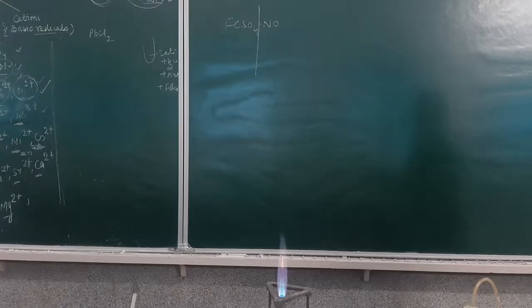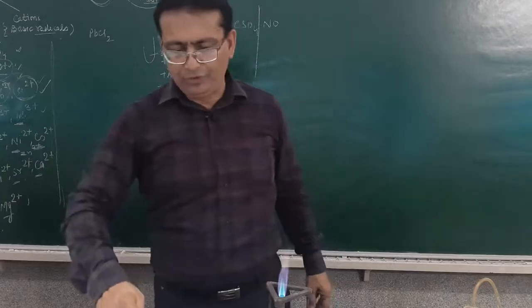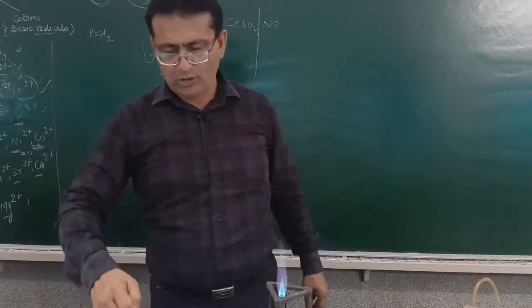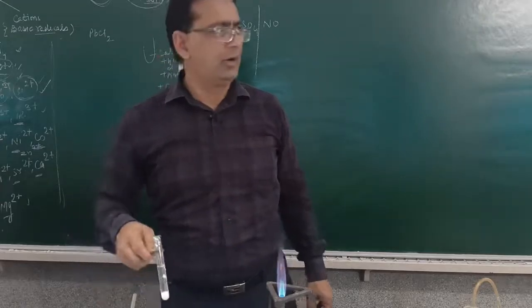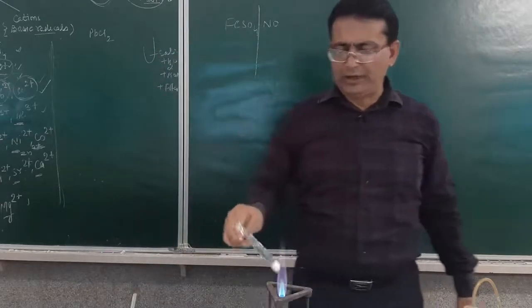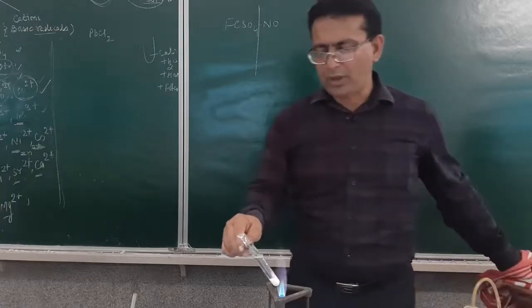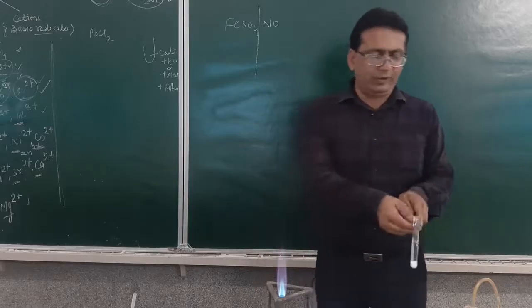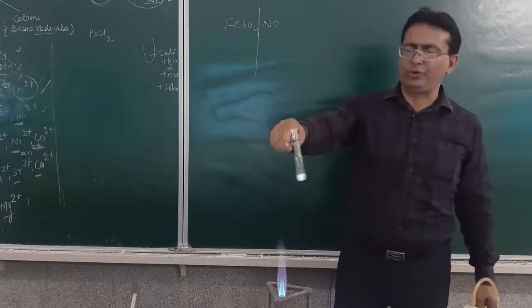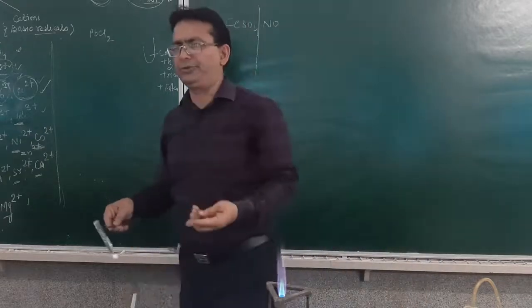So once it dissolves in the hot water, you have to take that solution. This is a solution of lead chloride. You may slightly heat this up also. Now, when it gets heated up, what you need to do is divide this solution into two parts. Divide the hot solution into two parts.